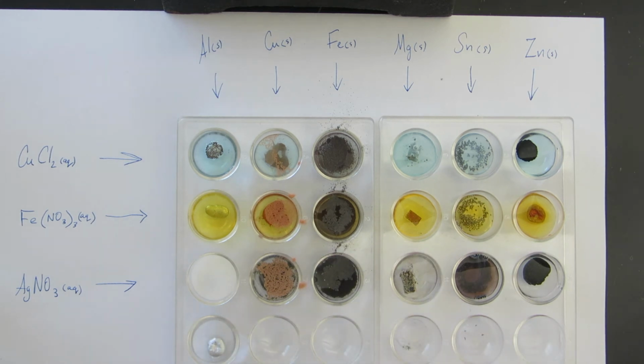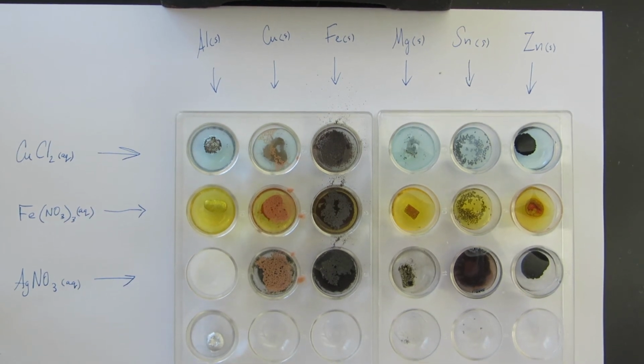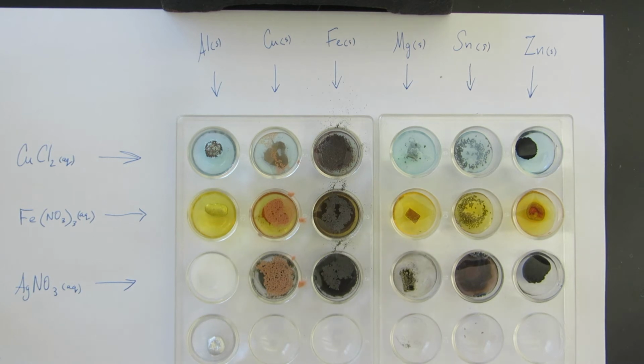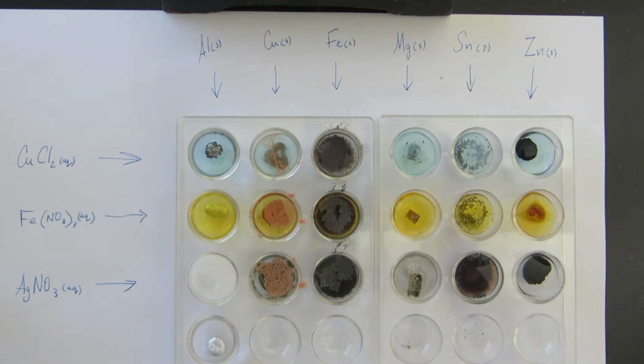So I don't know if the aluminum is going to react. Okay, so I'll let this go a little bit just so you can see any reactions that might take time. Nice thing about recording reactions is you can tell exactly how long it took.